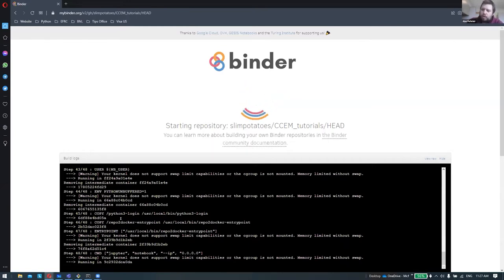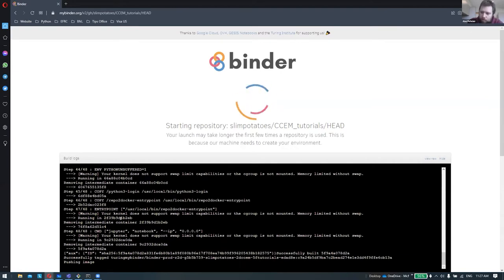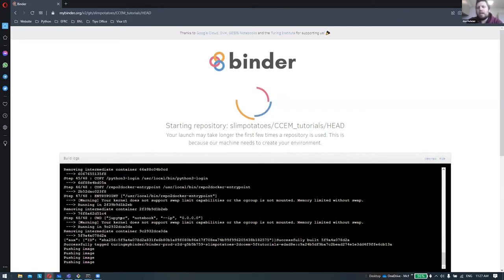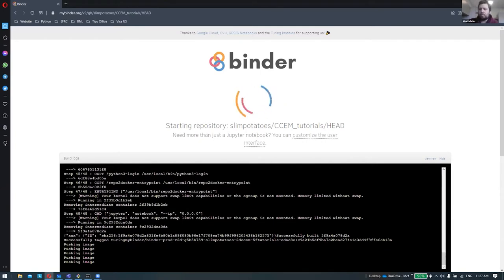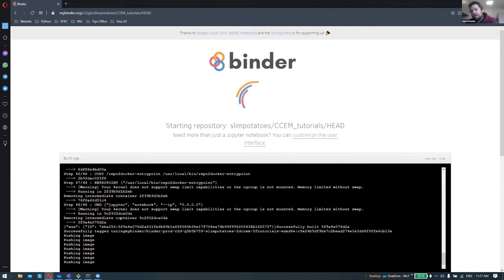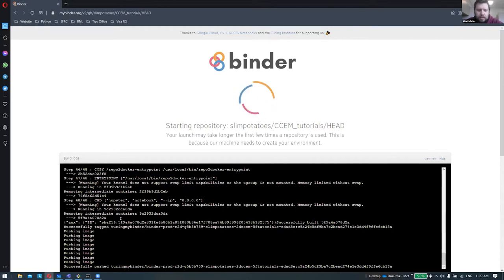We will go through some filtering, which will be in the idea of denoising, because you always have some noise in your data. Next will be thresholding, to separate the background from your features. And the last part will be what we call segmentation or labeling, which will be based on this separated data to then find some characteristics of them. So this is still loading.